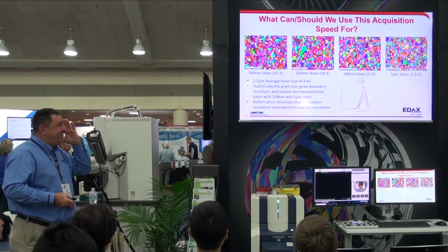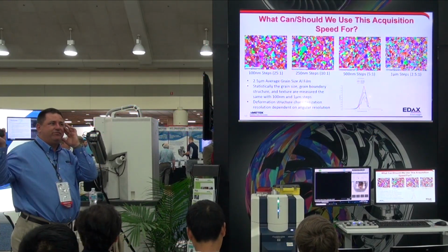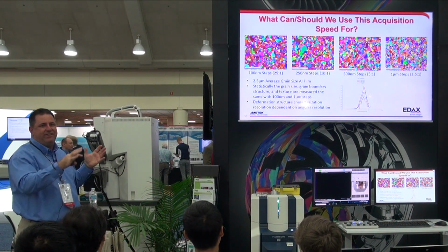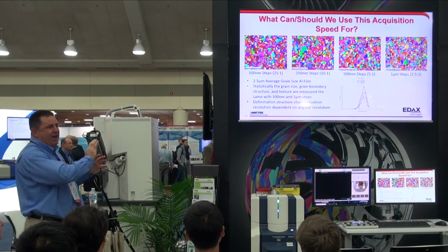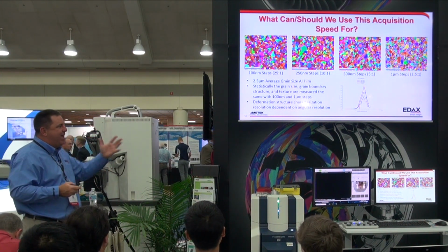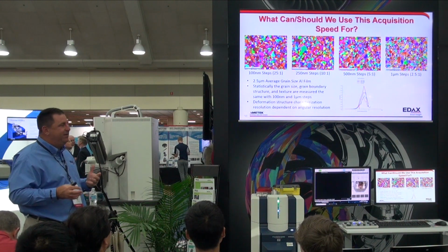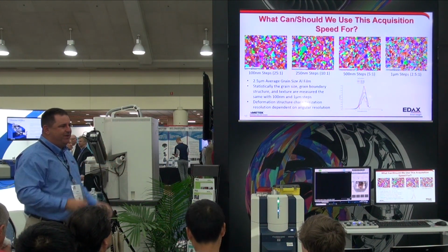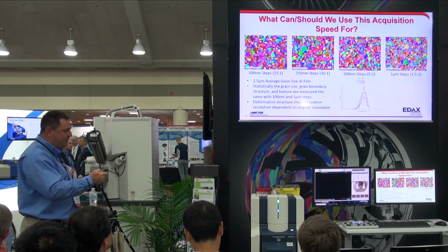But certainly there are talks in the symposiums where people are thinking of sparse sampling and how to sample space. I think it's unclear yet how this fits into that role, but it's an active question of how do you sample structures efficiently versus oversampling. At some point you're saying, I'm just throwing power at it that maybe you don't need to.